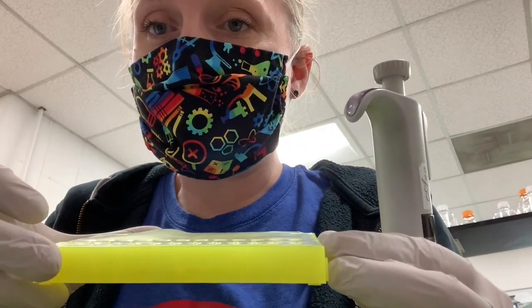So I've put 9 microliters of water in the first set of little wells that I made. And then I'm going to pipette using an RNase-free tip, 1 microliter of each sample into the corresponding droplet. Make sure that if you have multiple samples, you've gone ahead and put them in the right order. You don't want to have sample 1, 7, 3, whatever. You want to have 1, 2, 3, 4, 5, 6, 7, 8, 9, and so on. And make sure that you're paying a lot of attention. You don't want to pipette 2 of these microliters into the same spot or anything like that.